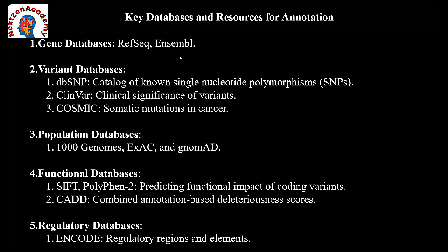If you want to use a regulatory database, that can be done with ENCODE. All of these are publicly available databases, chosen based on what we want to do.